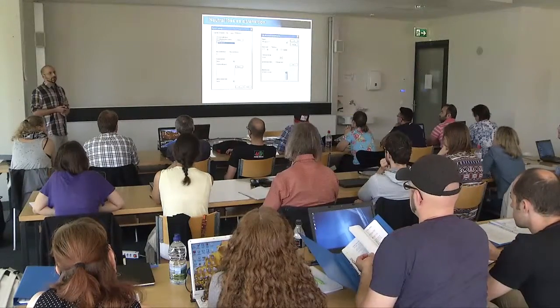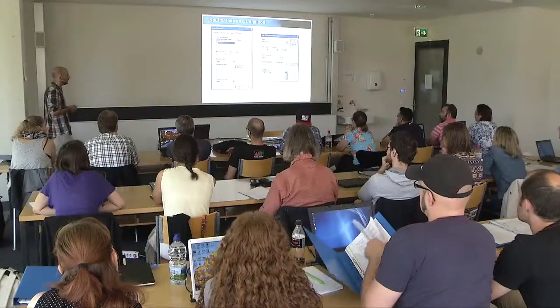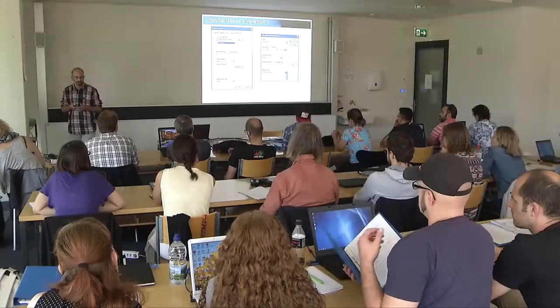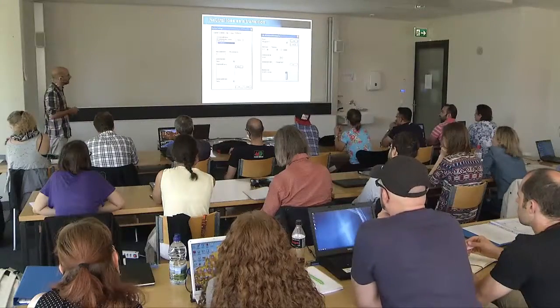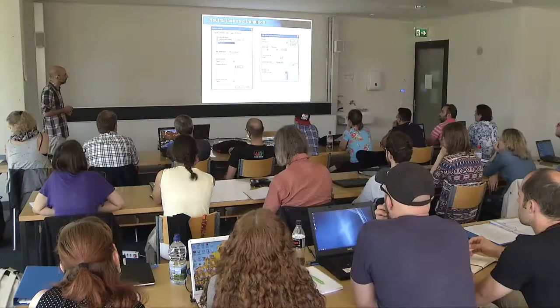So what we have in phosphopeptides and some other modifications is neutral losses. Neutral loss is the process in which we lose the phosphorylation during fragmentation. This is something that we can set up in Skyline. We would set here the number of neutral losses we want to enable, and here the chemical formula of the neutral losses.